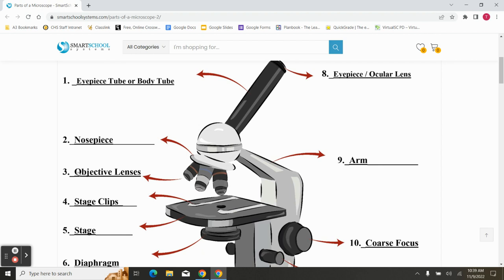To get the total magnification of the microscope, you multiply the eyepiece magnification times the objective magnification. Again, the objective is either going to be 4 times, 10 times, or 40 times. The eyepiece is always going to be 10 times magnification. So on our scanning lens, which is typically the shortest of the three, you get a total of 40 times magnification, 10 times 4.